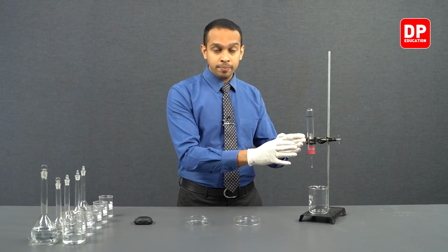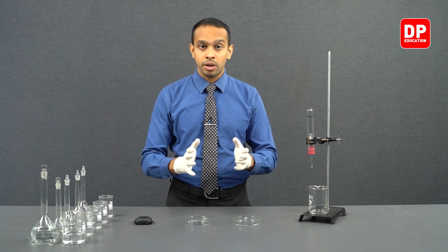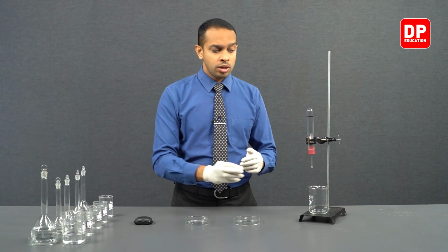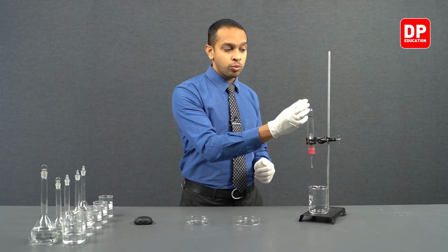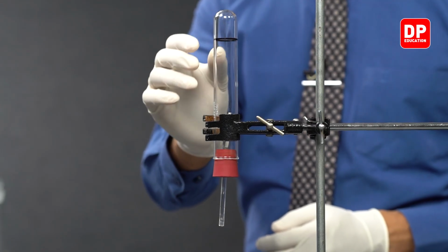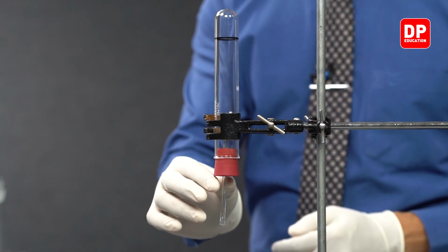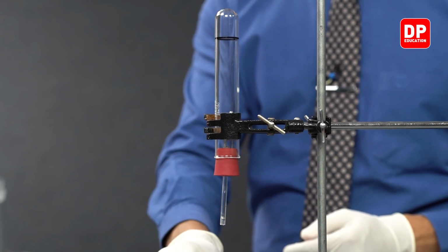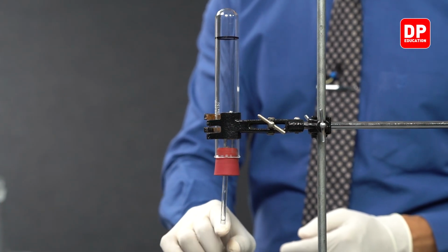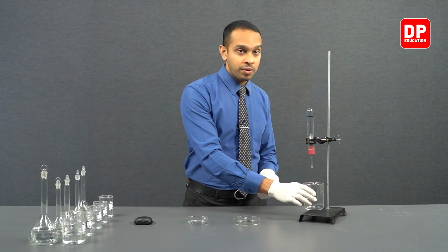As the HCl and magnesium come into contact with one another, there will be a reaction taking place, producing hydrogen gas. The hydrogen gas produced will be moving up and getting collected over here. The water that is displaced from this area will run through this glass tubing that we have here, and will get collected in the beaker that we have over here.